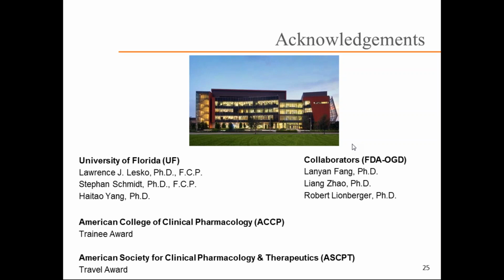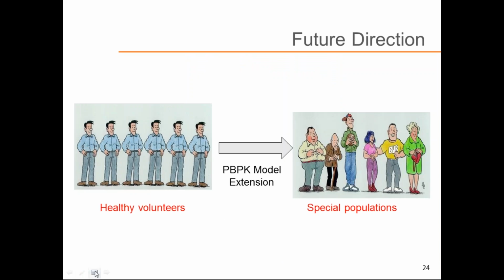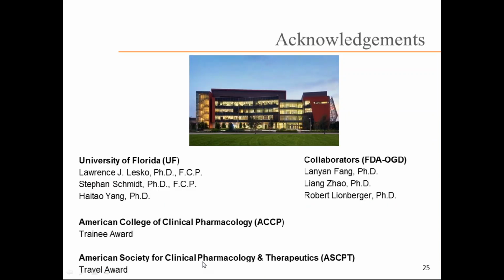Great. And then there's a question here. Can you let us know how DDDPlus can help in case we have USP4 dissolution data only for IM products? So I'm guessing that's intramuscular. Yeah. There is a USP4 model within DDDPlus, so you could model it as an IR, you would call it an IR powder in DDDPlus, and do some dissolution experiments in DDDPlus for that.